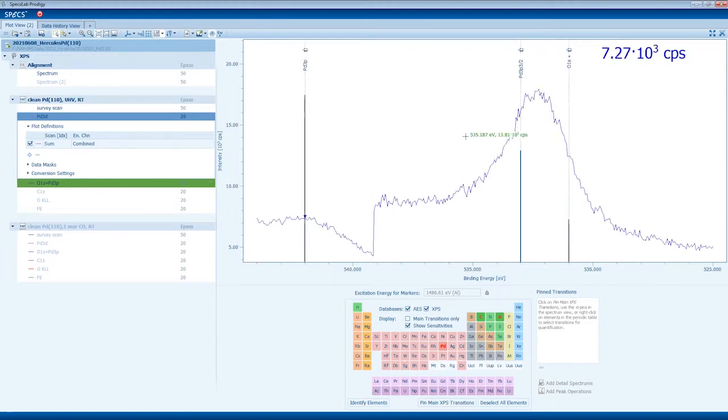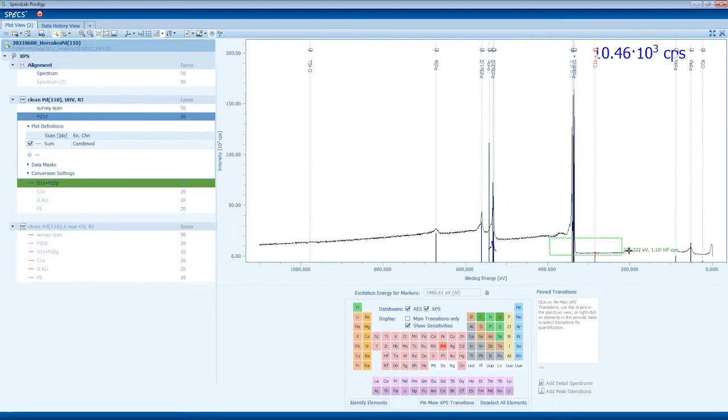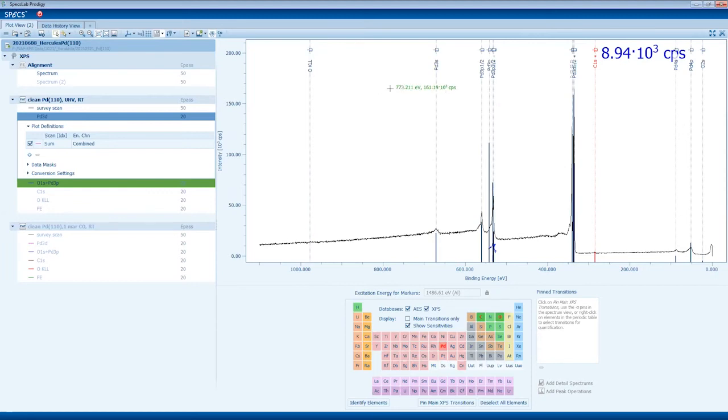Okay, now it's measuring oxygen plus palladium 3p. So you see here you have this palladium 3p peak, and then somewhere here should be oxygen. But of course, there should not be much oxygen at the moment. It's a clean crystal. Oh, I didn't check. What about the carbon? There's nothing. Oh, a little. Yeah, this is negligible. As I said, as soon as you put it into the cell, you always will see a bit of carbon.